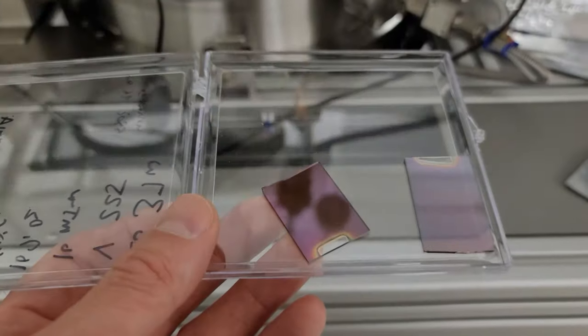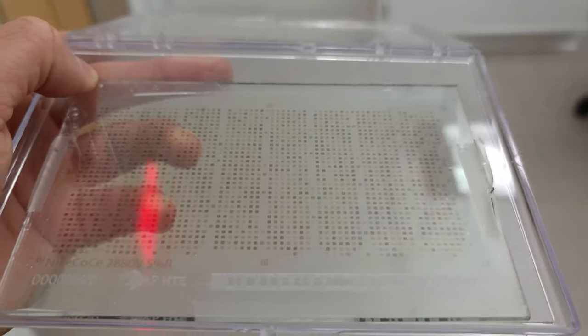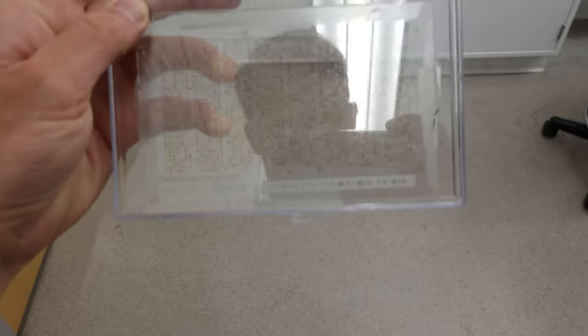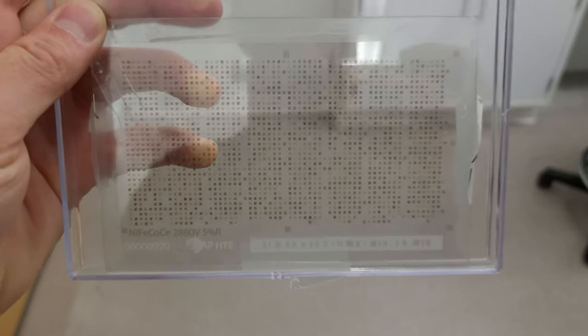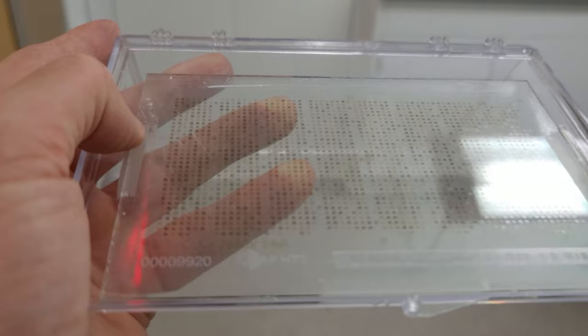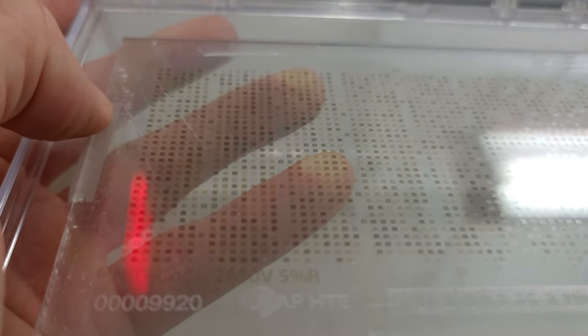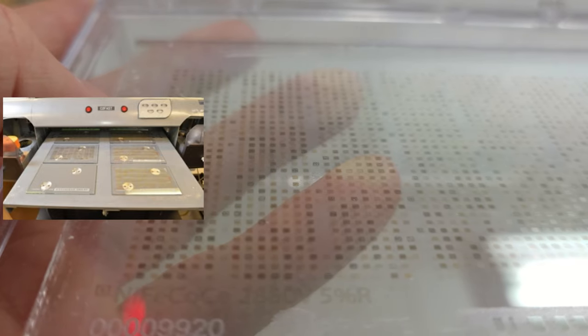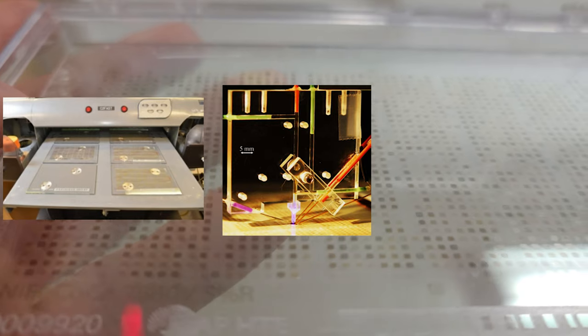And here's the result, a uniform coating of the copper-bismuth oxide ready to be studied. Thousands of new material compositions and catalysts can be rapidly screened using high-throughput synthesis and experimentation methods being developed at Caltech. Each inkjet-printed dot represents a unique four-element mixture which can be tested for its optical and photoelectrochemical performance to discover new semiconductors and catalysts with unique or tailored properties.